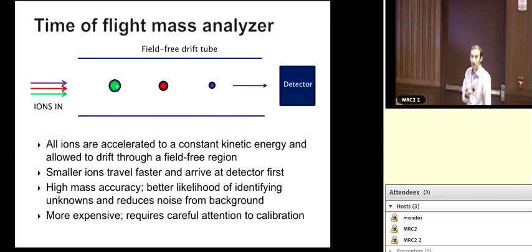You can use an effective LC method, as Steffi will tell you about, to separate the molecules of interest from something that would interfere, and sometimes that's all you need to do, and it doesn't matter what else is in your sample. You can get a nice clean separation on the front end, and your matrix effects effectively go away.